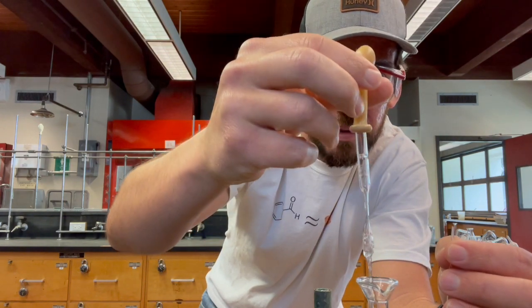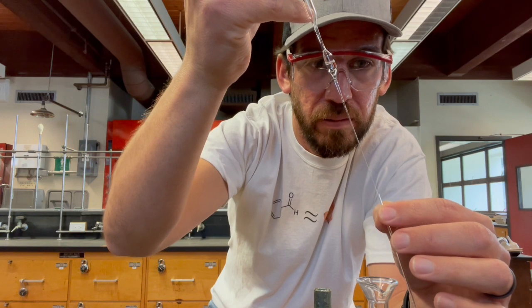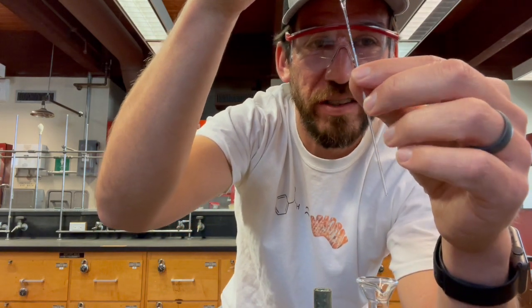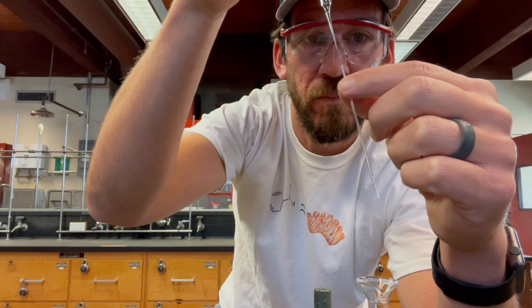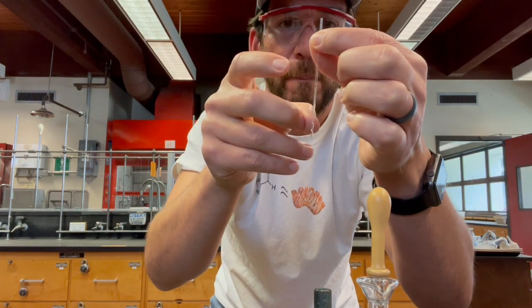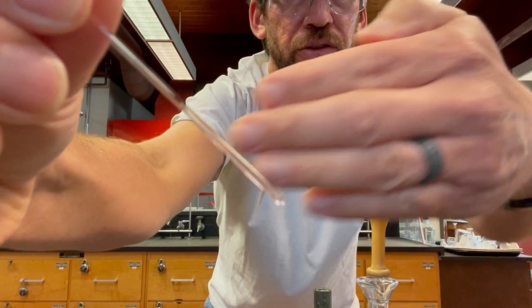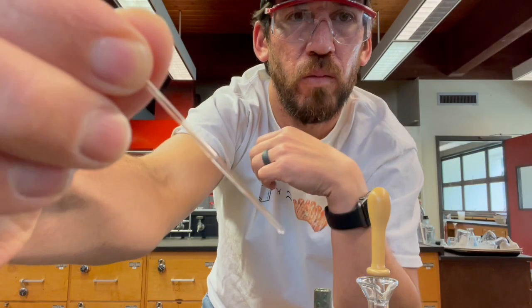Okay. So now it's kind of hard to suck up with this tiny little pipette. Key to get it in there is don't breathe. I wasn't breathing the whole time, and I got it in there, and then I took it out on accident. But push it down, go ahead, fill it up, just a little bit. All you ever really need is a little bit. Flick it to make the liquid go all the way to the bottom, because it wasn't. You see? Do you see? Okay? Right there.